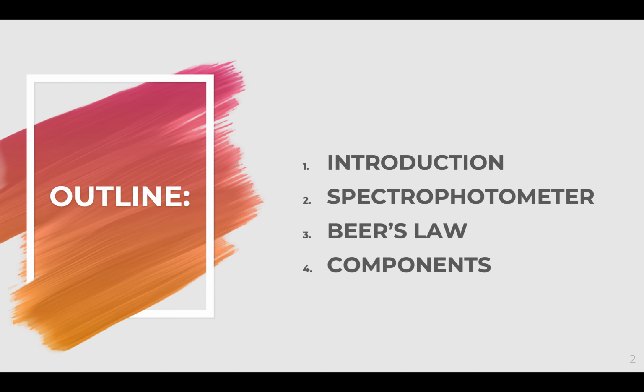I'll be discussing very important concepts with regards to energy, to your electromagnetic radiation, electromagnetic waves, and your Planck's law. Yes, your Planck's law. Next one, I will be differentiating your spectrophotometer to other photometric principles and instruments. And of course, I'll just be going through your Beer's law quickly.